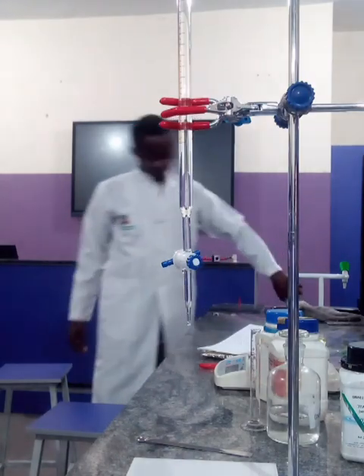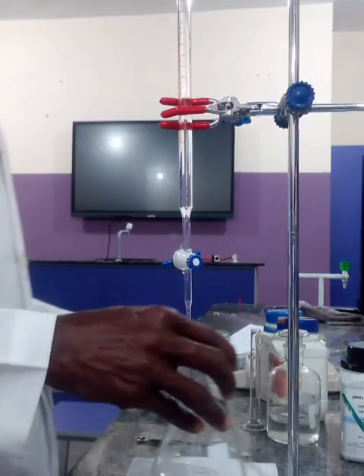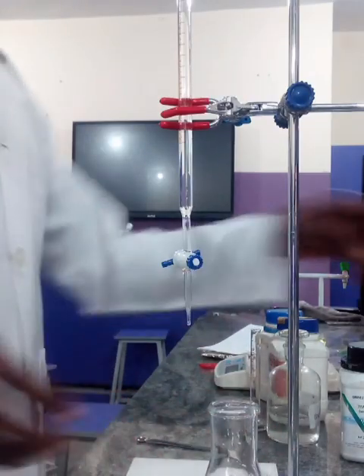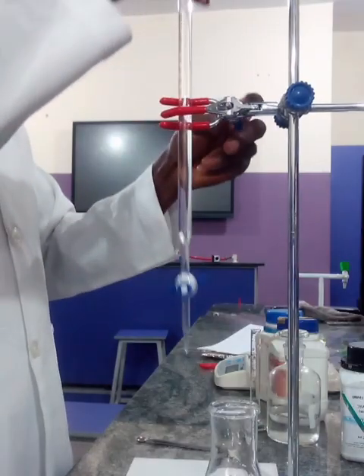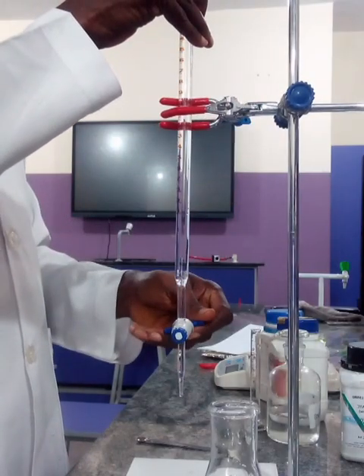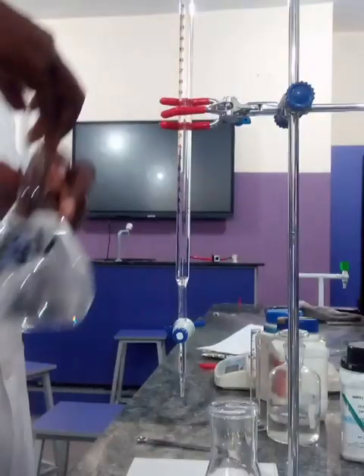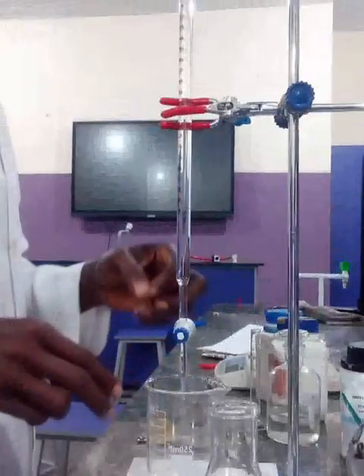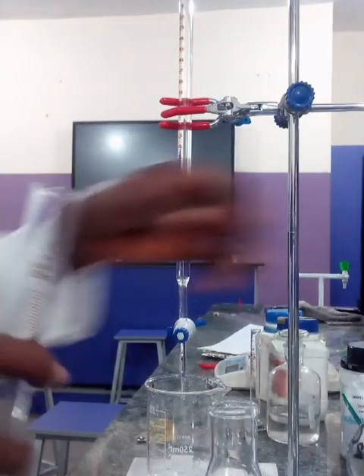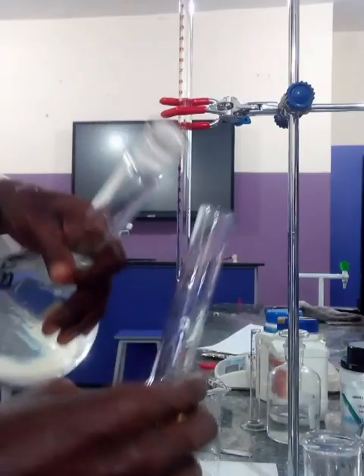Let's say you have measured 25 cm cube of the bleach solution that you have prepared into a conical flask. So you add 10 cm cube of the 2 mole per dm cube HCl solution, and this acid will help to reduce the sodium hypochlorite to chlorine. So you have chlorine solution in the bleach.